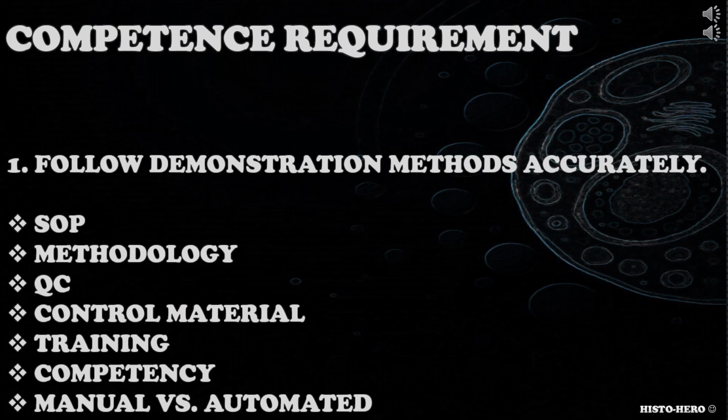When addressing this competence requirement, candidate could consider SOPs, method used, quality control, use of control material, their training, competency, the importance of following the methods accurately.